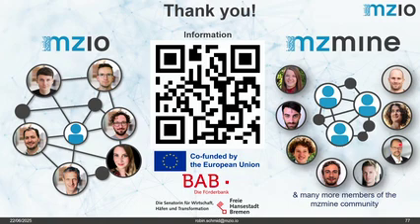Yeah, thanks for the workshop. Almost only conclusion words, but I just have a precise question. There are 2 or 3 mzmine versions where you have the possibility to directly upload raw files. But in your presentation, you always use mzML. Is there a reason why? Or is it one step less, or do you always wonder why you convert yourself?